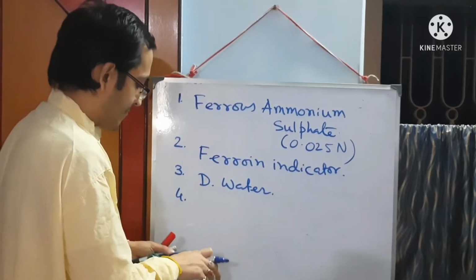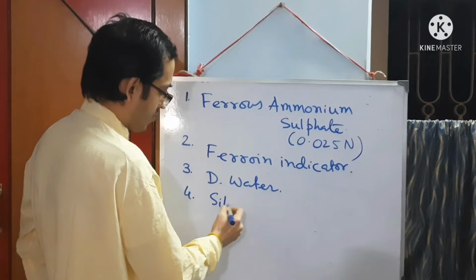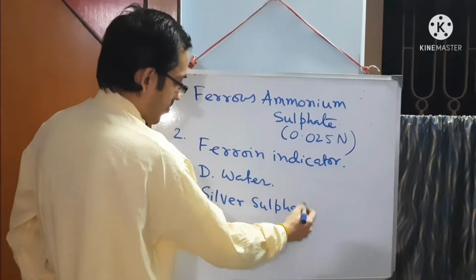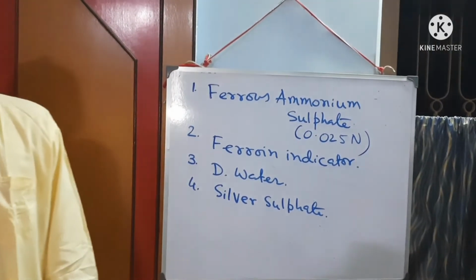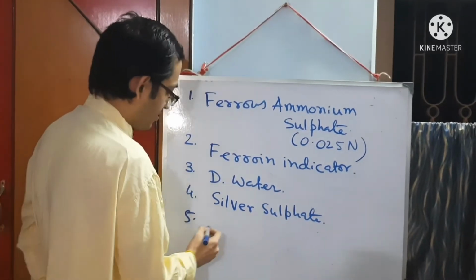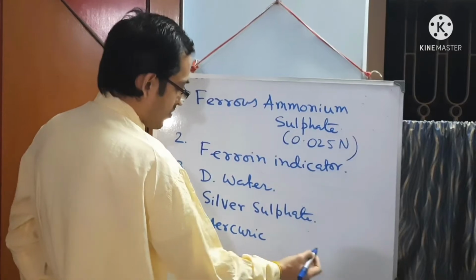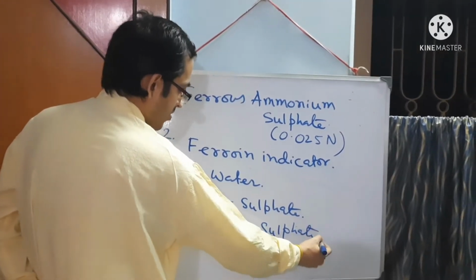Next, silver sulfate. Next, mercuric sulfate.